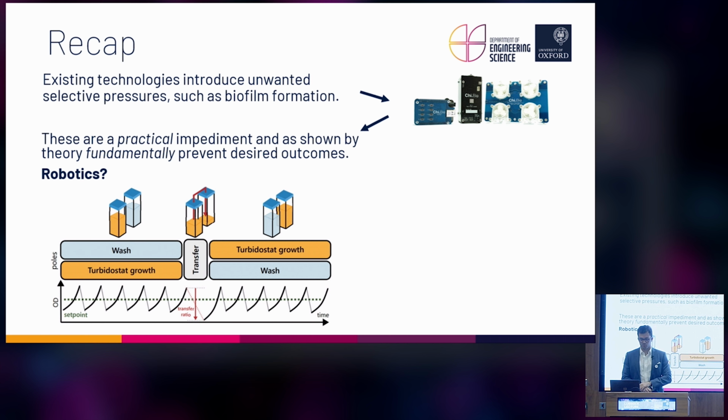We try and build solutions which can actually fight against this. And so our big problem of the cells sticking to the glass is something we can actually overcome with some very clever cleaning systems where we actually have now pairs of reactors which are self-cleaning.